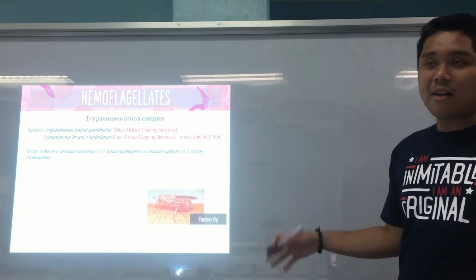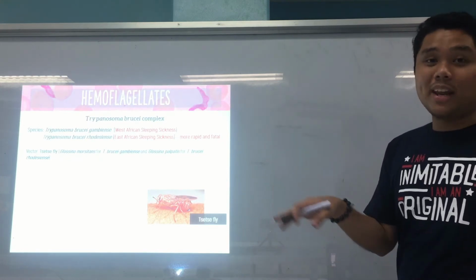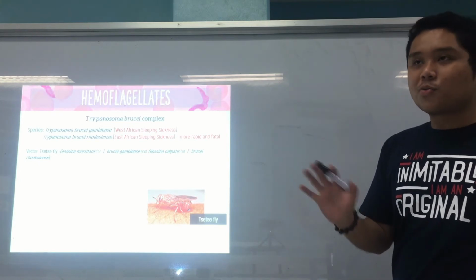It is very common, again, in the African region, and that's why most of our trypanosomes, Leishmania, and filarial worms are also found in Africa.